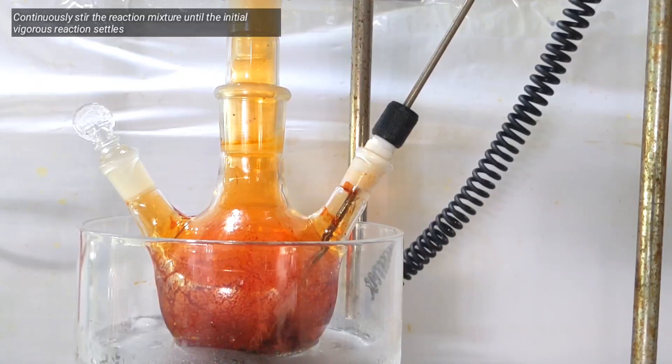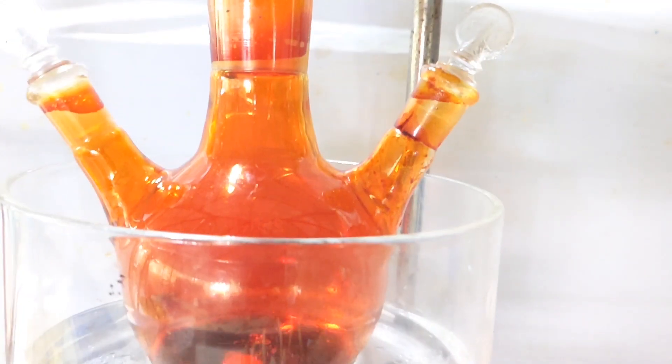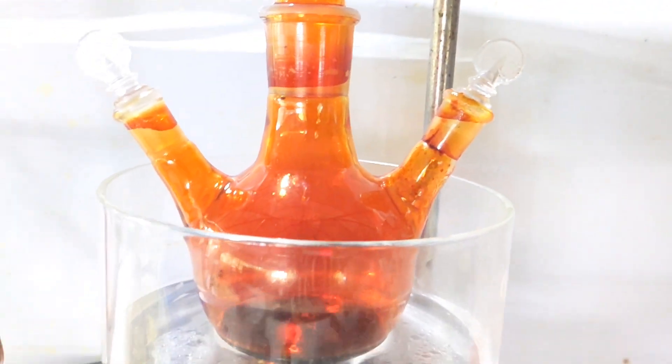Once the vigorous reaction settles down, slowly increase the temperature to around 60-70 degrees Celsius and maintain for around 40-45 minutes. Most of the unreacted bromine will now be removed.